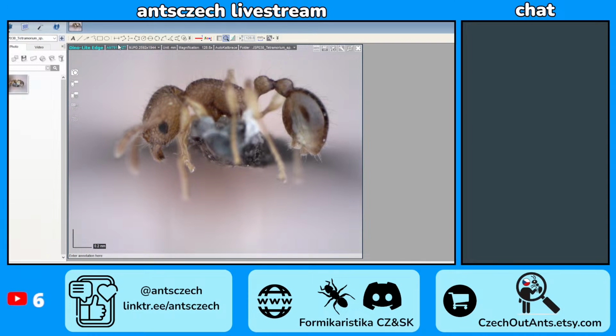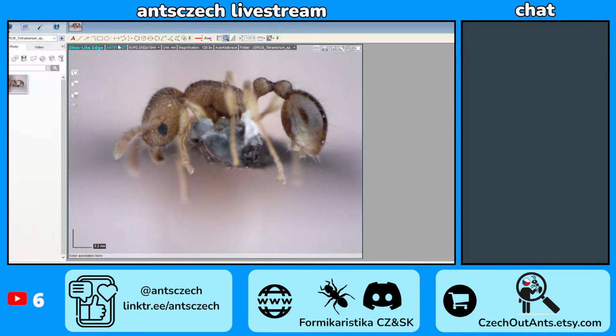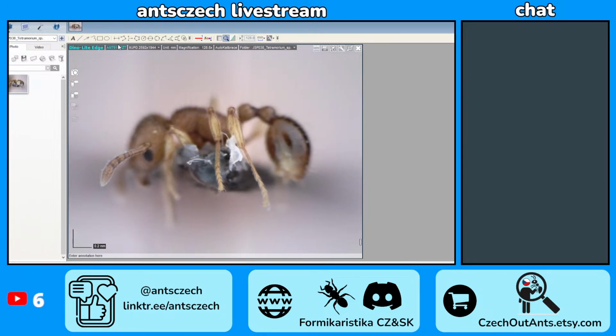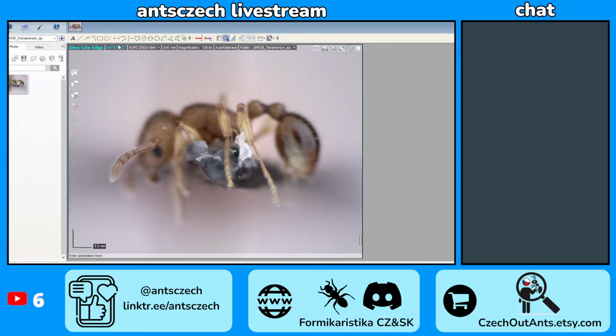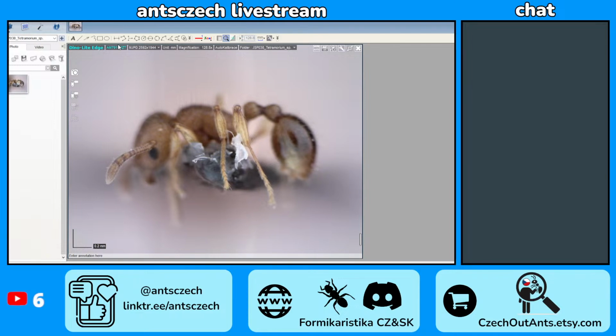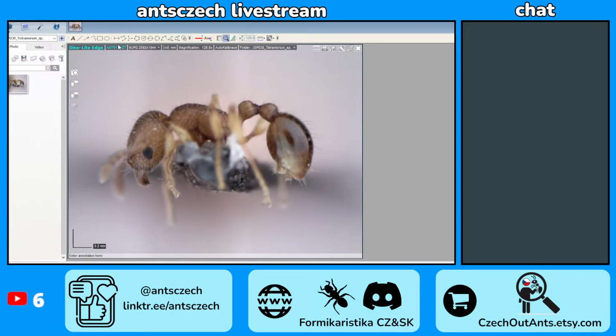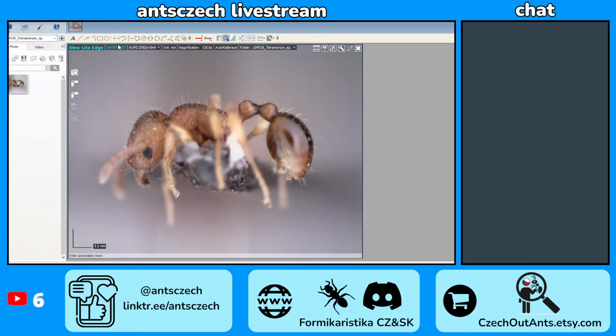If they would sell just one product and it had everything, I think it would be easier than selling 10 different products and one of them not having 50 times magnification and the other not having a 2 megapixel camera and a 5 megapixel camera. It's too complicated.